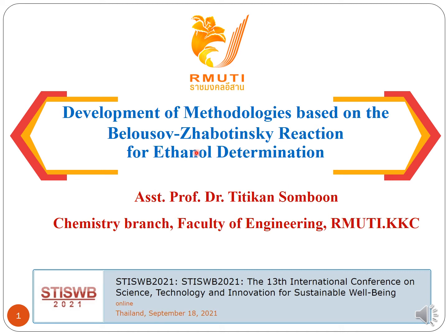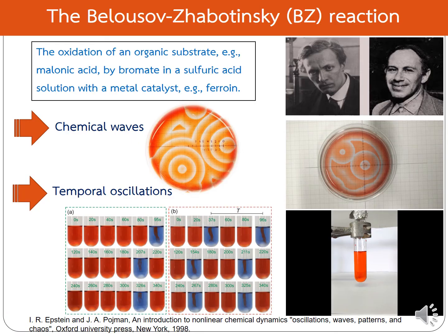My name is Somboon. Today I would like to present on the topic of development of methodologies based on the Belousov-Zhabotinsky reaction for ethanol determination. The Belousov-Zhabotinsky reaction is the oxidation of an organic substrate, for example malonic acid, by bromate in sulfuric acid solution with a metal catalyst complex, for example, ferroin.